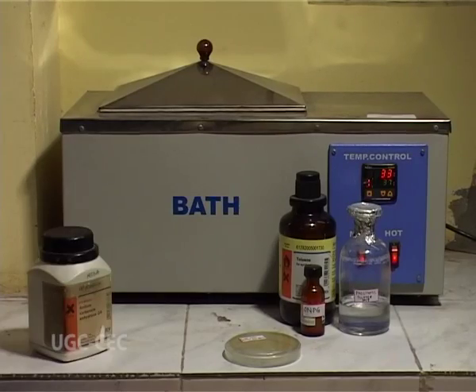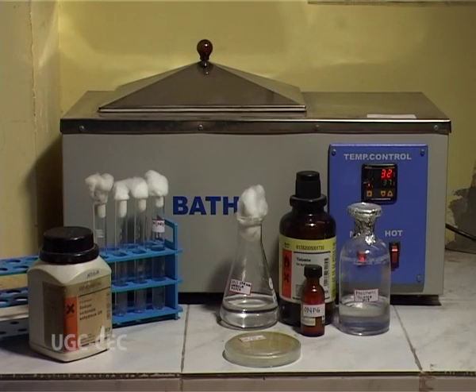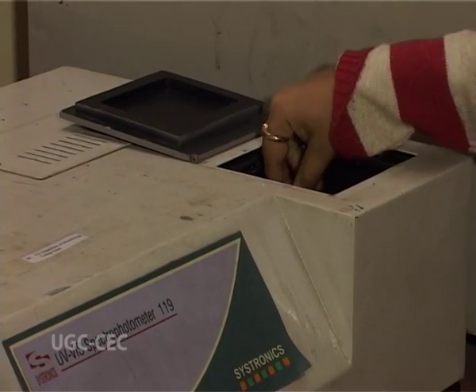Then we need sodium carbonate to stop the reaction. And the media in which we will be growing E. coli is a minimal media, which is called Cold Spring Harbor A media. Then we need test tubes, caps, racks, an inoculation loop, pasteur pipettes, and a water bath, which is to be maintained at 37 degrees centigrade. We need cuvettes for the spectrophotometer and a spectrophotometer.